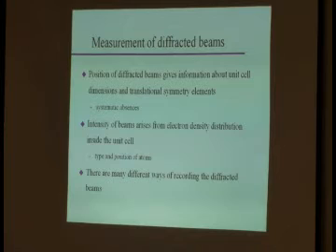What data collection really is, it is the measurement of diffracted beams, right? Because we have by now established that the position of the diffracted beams tells you about the unit cell size and shape, plus the absences of reflections in this regular pattern tell you something about translational symmetry elements. Remember, all translational symmetry elements will give you systematic absences.